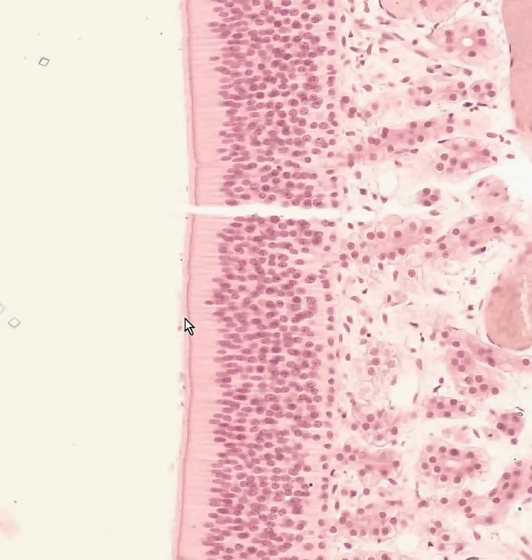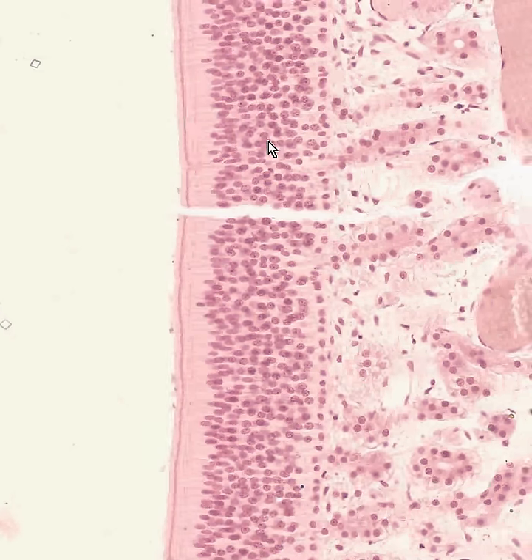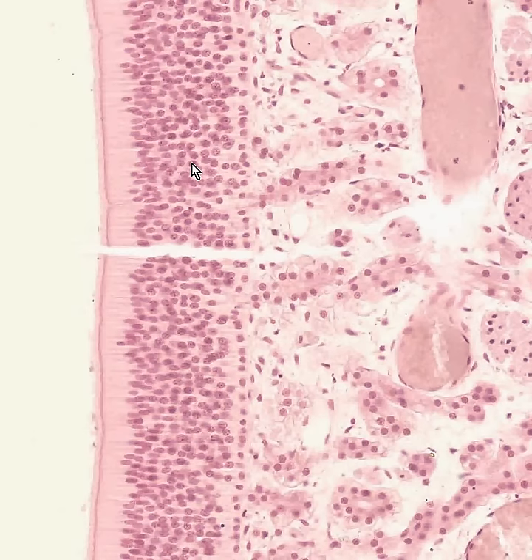And these are probably the best cilia that you'll ever see in your life, in which we have cells here in which the chemical process changing dissolved molecules will eventually be translated into nerve impulses. This is the olfactory epithelium, and here's the basement membrane of the olfactory epithelium. And these cells are the actual nerve cells and probably some supporting cells as well. And here you can see nice cilia as well.